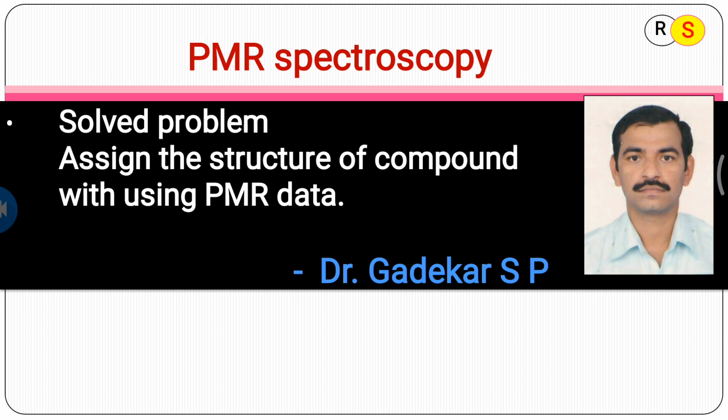Today we are going to learn how to solve problems in PMR spectroscopy, assigning the structure of a compound using PMR data.